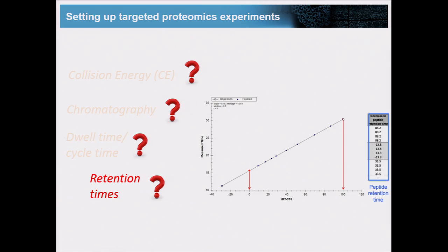And last, we discussed quite extensively the concept of retention times, since this is a concept that we use throughout the course, and explained a bit about this whole concept of using retention time indexes, how to convert retention times in minutes into iRT values that don't have a unit, so that we can store them, transfer them, and use them again and again for retention time prediction by using a set of standards and then measuring our peptides in relation to these standards.